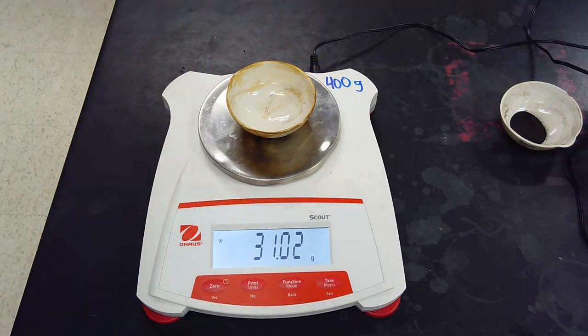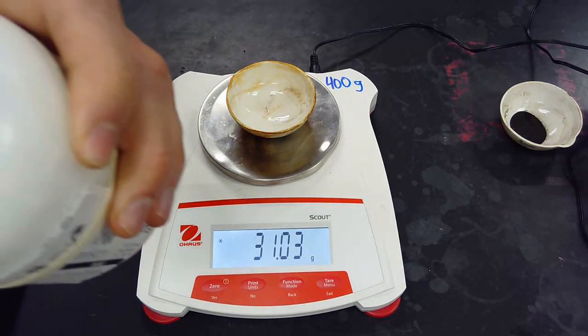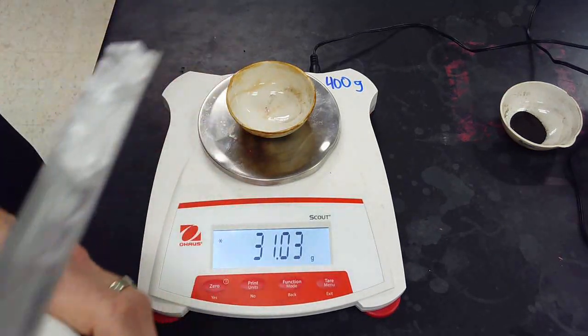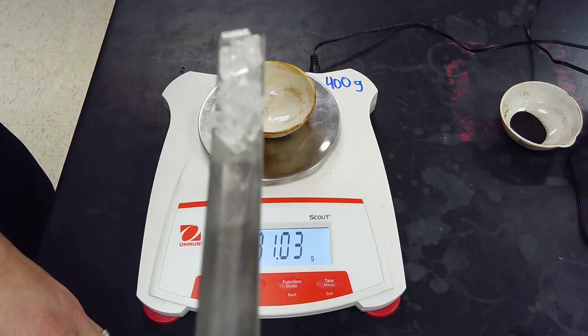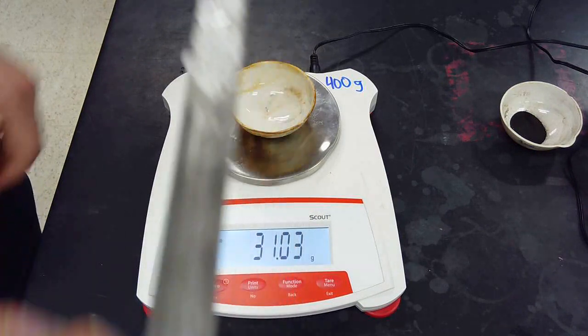Okay, let's take a look at this guy. This is sodium thiosulfate, which is Na₂S₂O₃ with the hydrate of water. You can take a look at this one — it's a little bit harder because you can see they're clear crystals, pretty big.